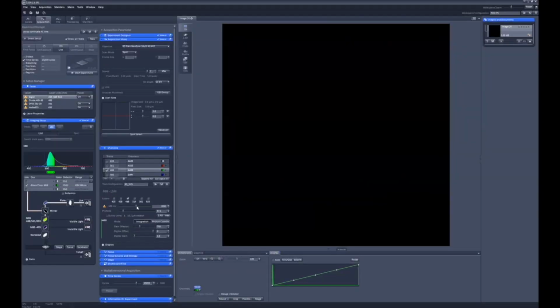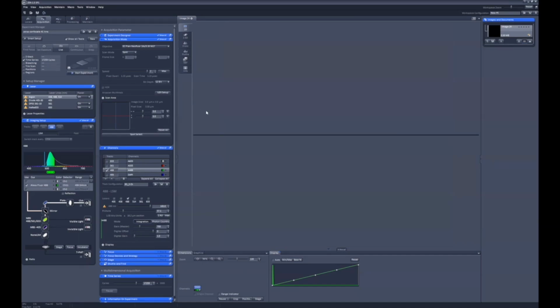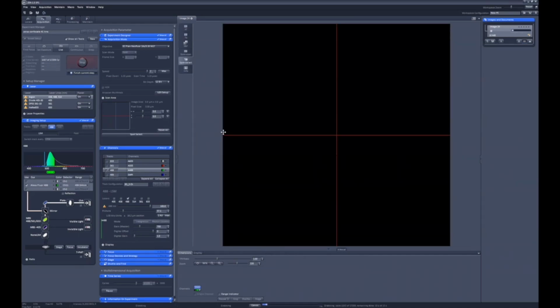All you need to do is configure a laser track with 100% power with the fewest pixels to scan, maximum zoom or spot mode, and with the maximum pixel dwell time or lowest frequency. Then run a scan long enough to measure the laser continuously over time.